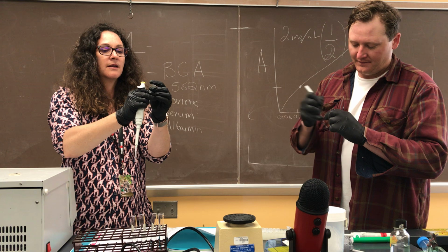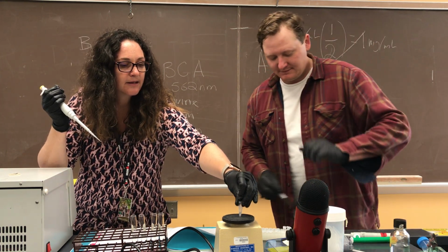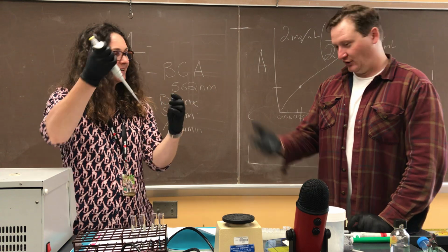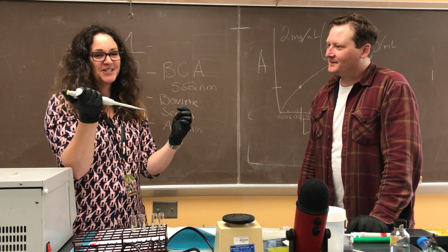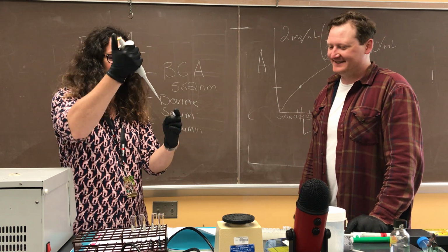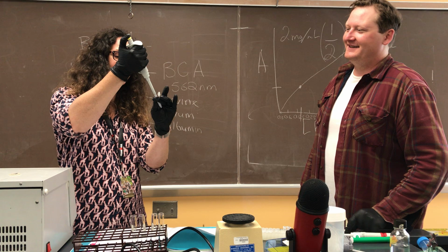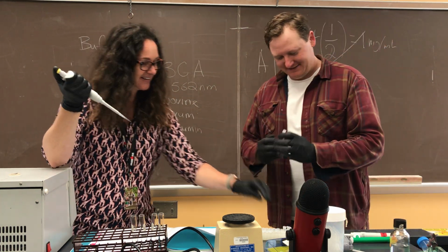Okay. And vortex again. Looks good to me. We'll do it again. Usually you would probably want to change tips. I'm economizing here, it's just for demonstration. So we're saving our planet. Yes, one tip at a time. Okay, there's C.